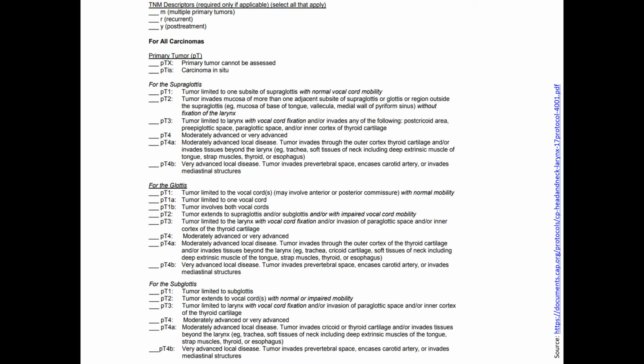The classic view of a larynx is opened up along the posterior side, just as you were showing a second ago. Just being able to see where that tumor is, and to correlate what I'm seeing, or what you're seeing grossly, with the radiography. And then the other thing I correlate with is the laryngoscope report. At minimum, every one of these patients has one laryngoscopy done at least a good 2 or 3 weeks before surgery, and then they almost always have one done immediately pre-op.